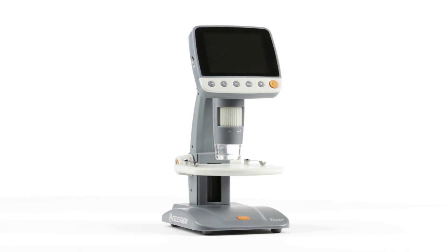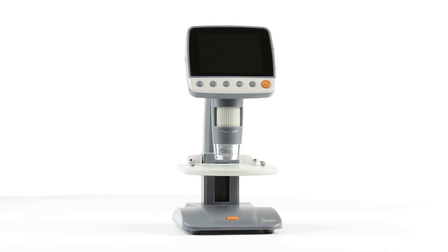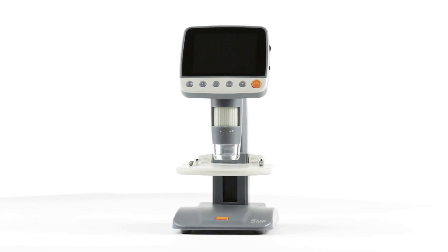What will your next microscopic discovery be? With the versatile InfiniVue Digital Microscope, the possibilities are endless.